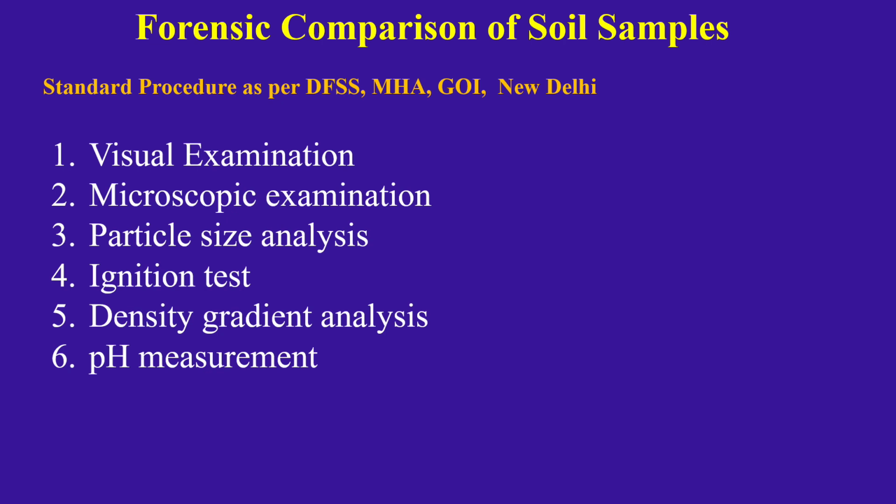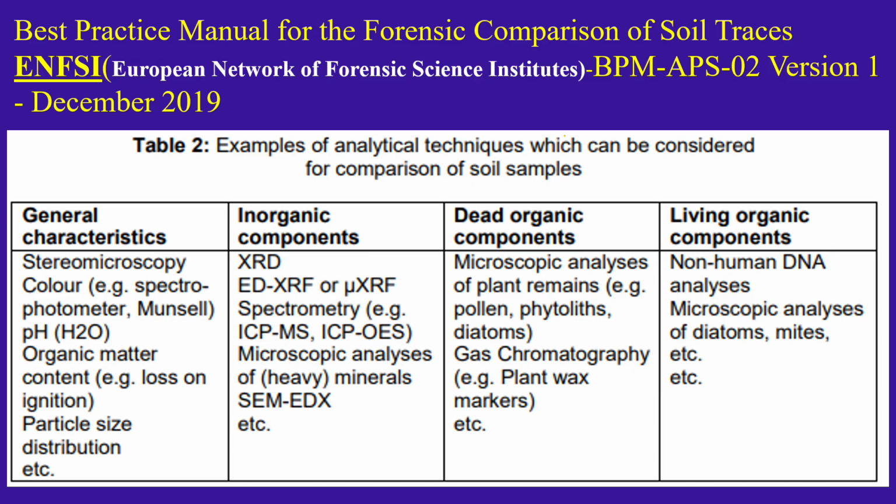As per the standards of DFSS, MHA, Government of India, and ENFSI, the European Network of Forensic Science Institutes, these standards have described different methods for comparison of soil samples.